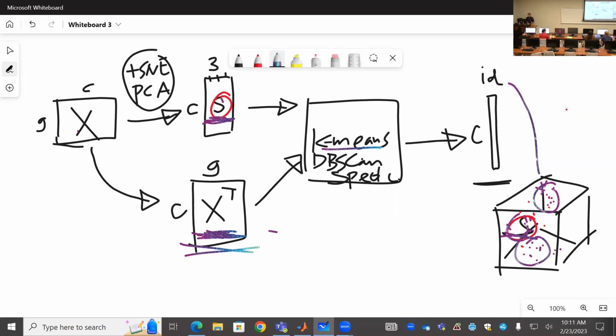In general, the flow chart on the top should be fast, because you compress the variables describing cells into just 3 or 4 dimensions, whereas the bottom one should be slower. Just keep that in mind. We will try those different paths and see what we get, using the real data.